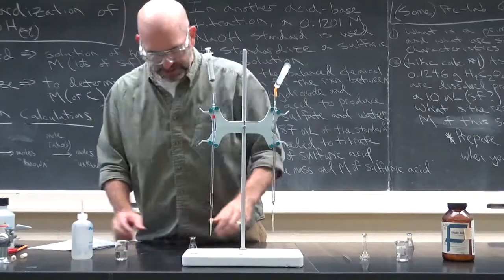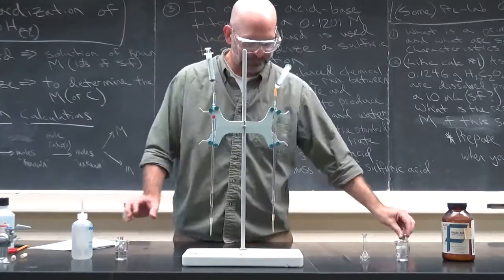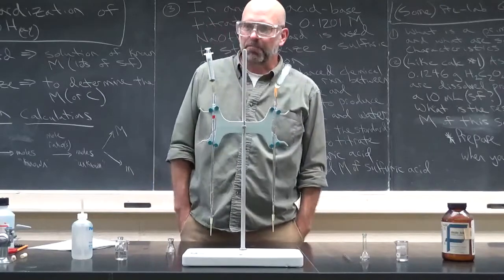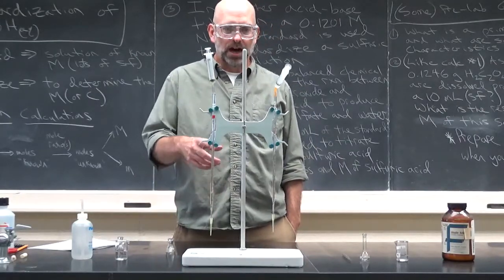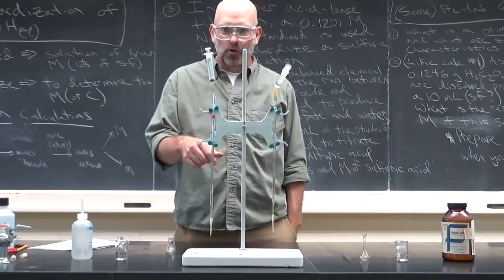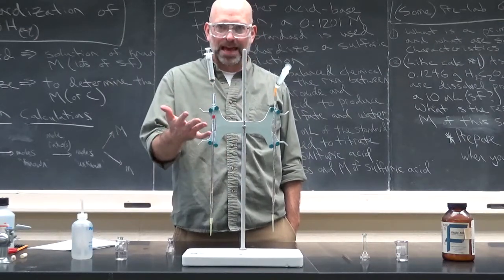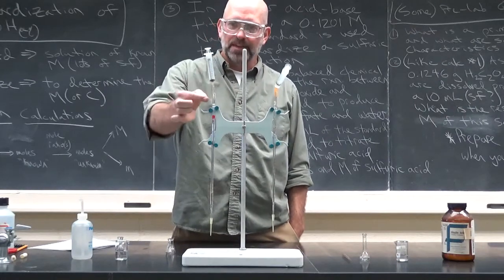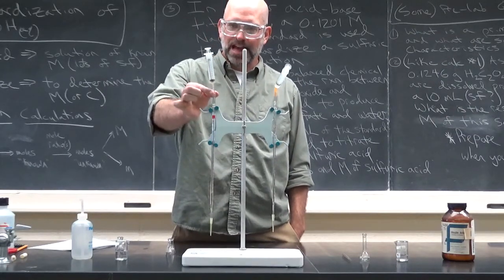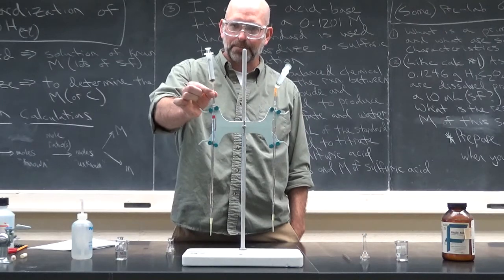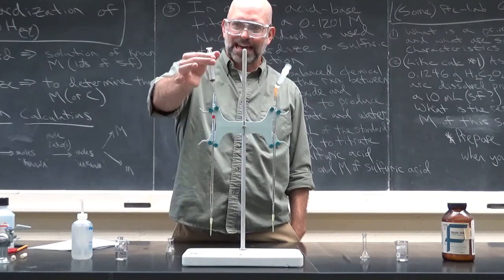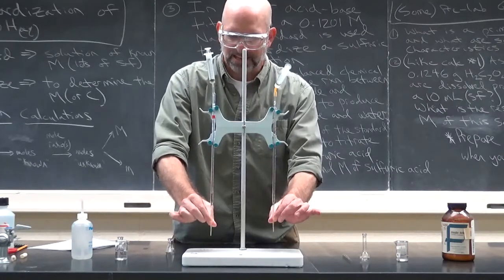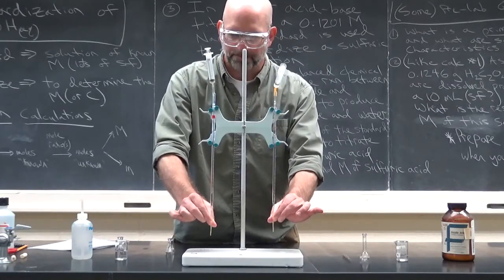So to do a titration, you need a few things. The procedure is explained pretty well. You're going to have all this laid out for you, and you'll assemble this apparatus. It's a pretty simple apparatus. This is the micro-burette. This is all in the handout, and it will have this piece of tubing attached to the top. You take the syringe and attach it to the top, and you take this plastic tip and put it on the bottom. Make sure these plastic tips are on there pretty firmly.